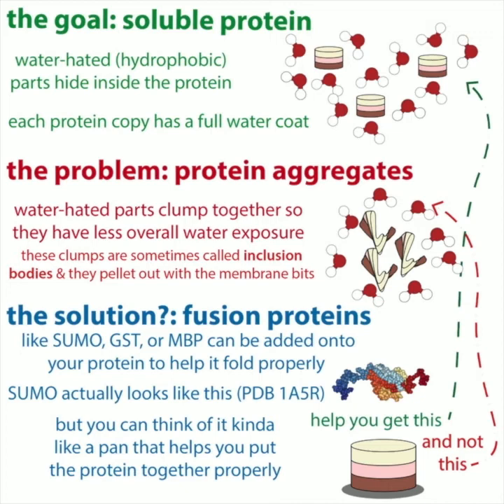And so as I talked about, you have these problems where your protein forms aggregates. One of the solutions that you might want to try is, as we talked about, lowering the IPTG concentration and decreasing the expression temperature. So instead of expressing it at 37 degrees Celsius for a few hours, you can express it at 18 degrees Celsius overnight. You can also reduce the expression time. Those are things you could try to make less of the protein. You could also try different expression cells.